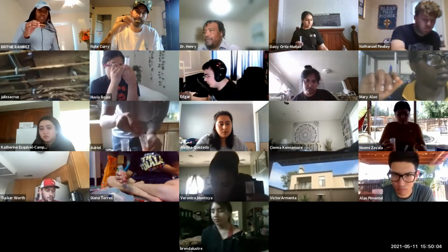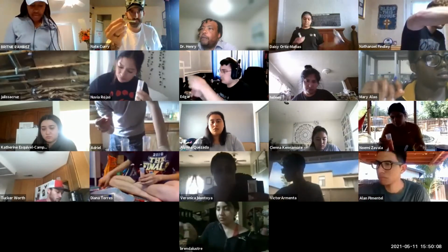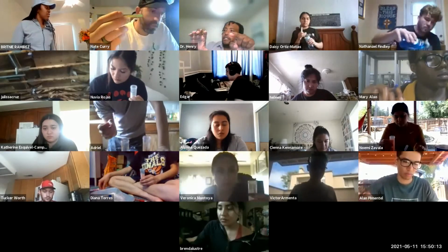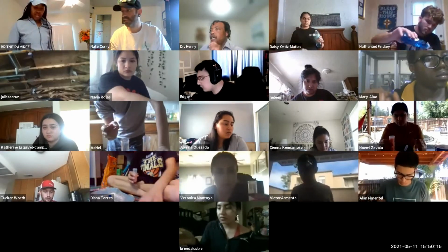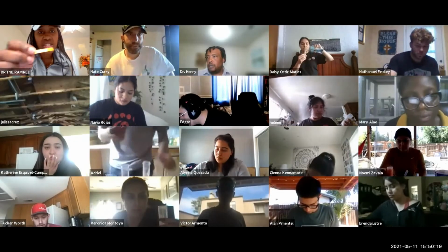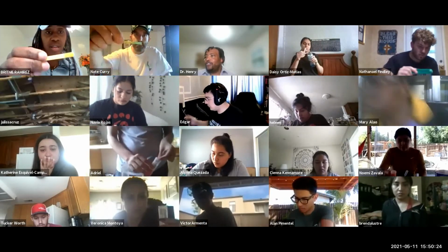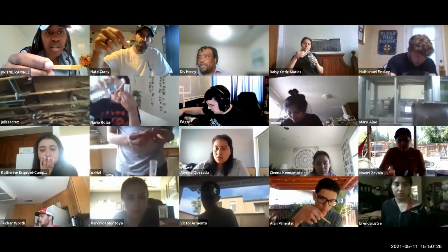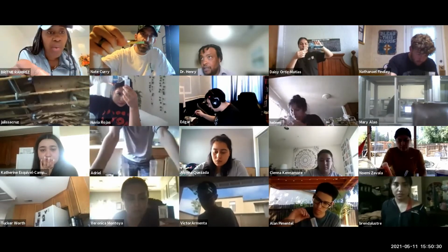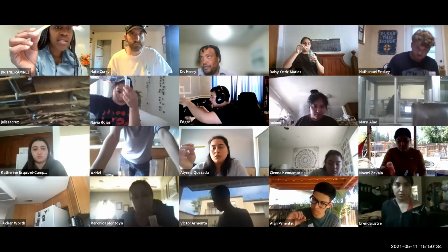Oh, it got soaked up. There you go. All right. It turned green. Okay, second. And then you want to match it up to the chart. Did you guys get a color chart? No. It tells you the different pH. I'm assuming yours is probably the same. No. You don't think mine works? Mine just looks like a wet strip. That's good because it should be neutral at this point because you have an acid and you have a base, right? Mine's like bluish green. Mine is green.